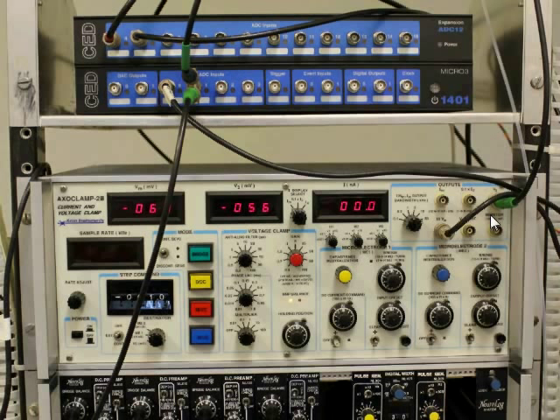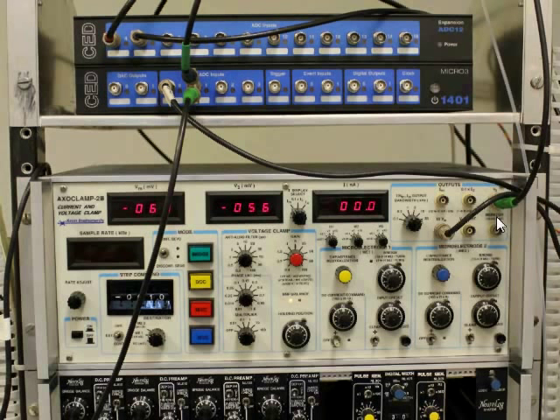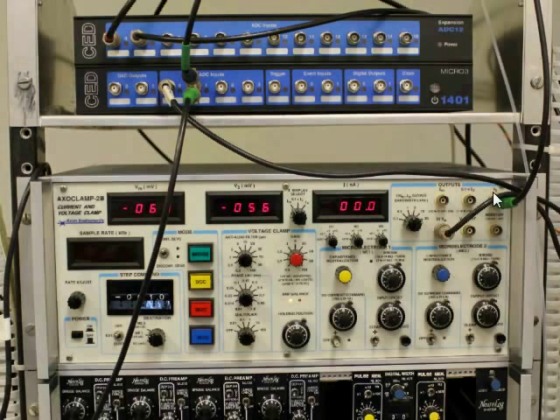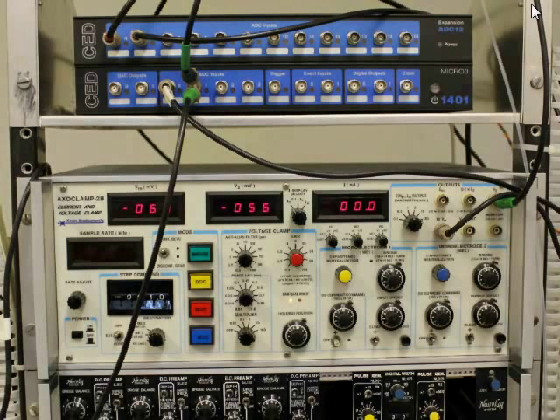And here we're taking the voltage from the other head stage, which is called V2. And we're actually filtering it through an extra amplifier with a 10 times amplification as well.